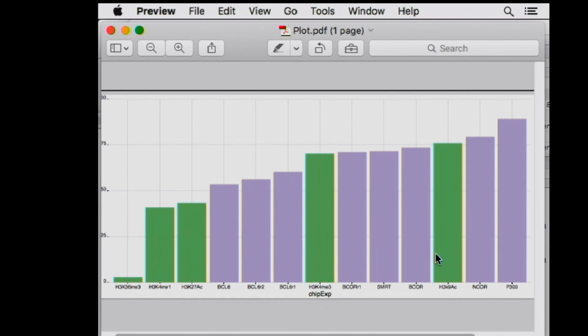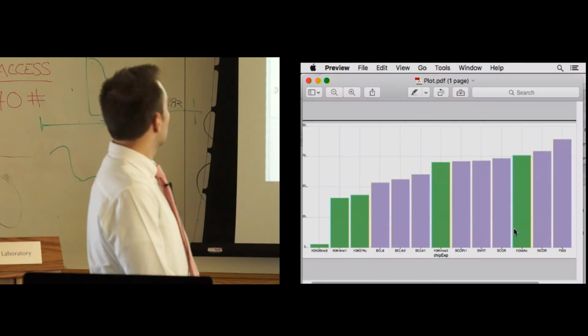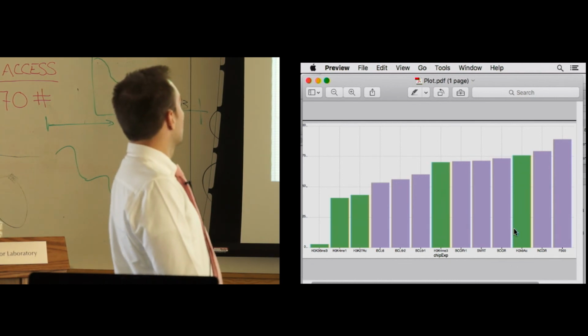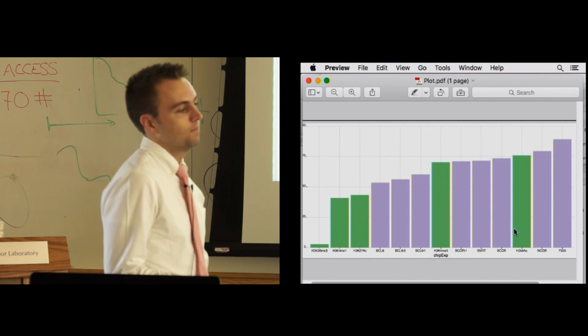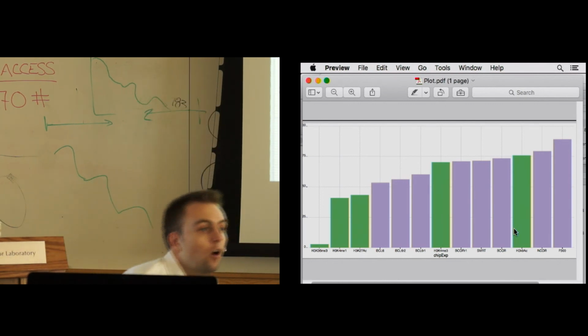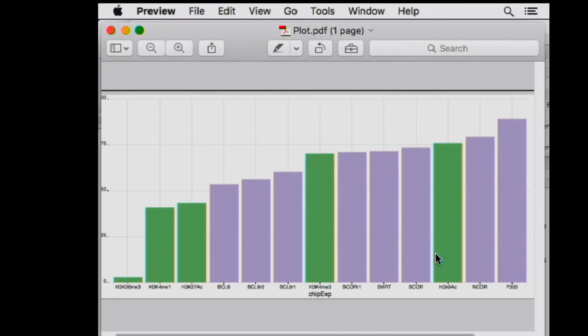Is it normal that H3K27 and H3K9 have such different overlap with the ATAC? Yeah, I think so. To some extent it is the first time some of these experiments have been done. Although I'm sure people have probably looked at DNase-seq overlap with H3K27 and H3K9. So that would be a cool thing to look at. Did they see similar overlaps?